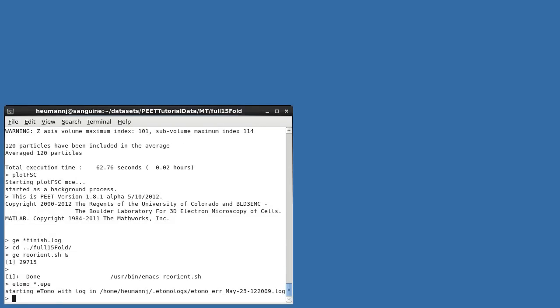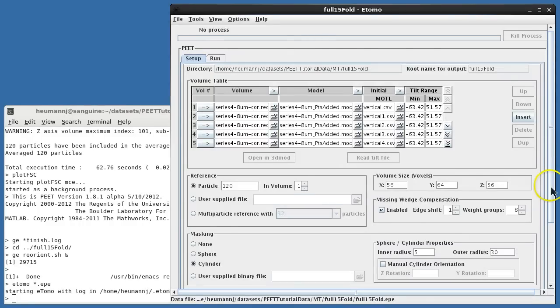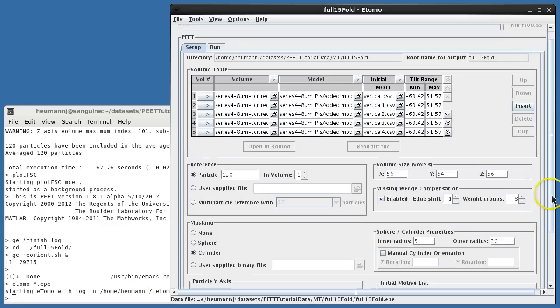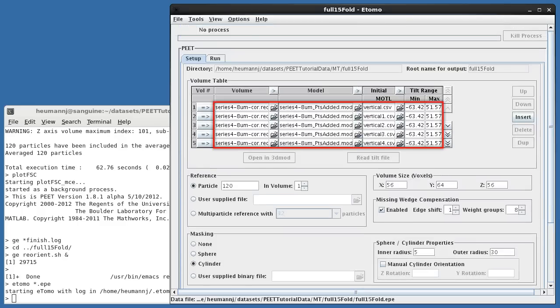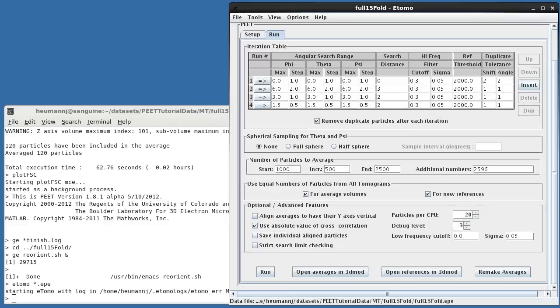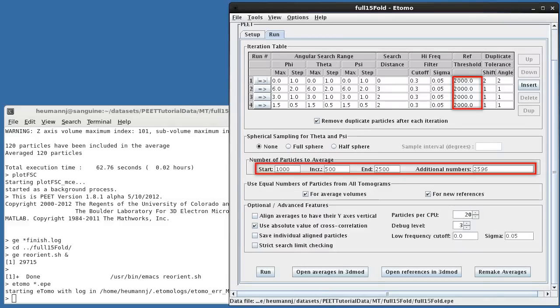To perform the symmetrization using project full_15fold, I've now specified user-supplied CSV files, and have listed the input volume and model 15 times, five of which you see here, each time referring to one of our newly generated motive lists. On the Run tab, I've increased the reference thresholds and the number of particles to average 15-fold.